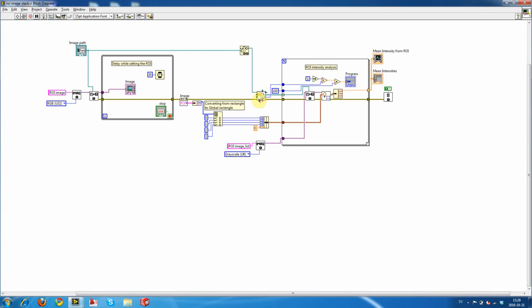It's very high level, I would say. It doesn't really care what's in the folder, it just lists everything. And you can find out exactly what's in there. You can exclude certain subfolders. You can tell it to look for a particular pattern. So if you have, as in some examples, file names that have something which indicates which channel they're taken from, we can apply a little channel filter and say, look, we only want to look at channel 1. So then it will only tell us which file names have the name channel 1 in it.